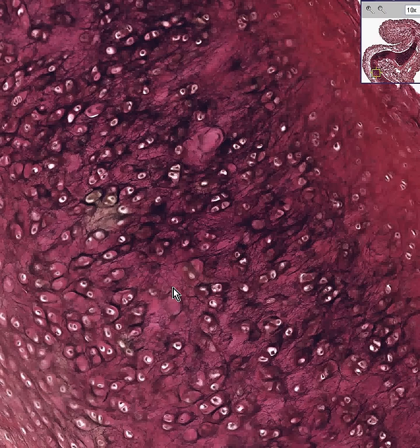Once again, if this was hyaline cartilage and you stained it with the elastic stain, you wouldn't see these black fibers.